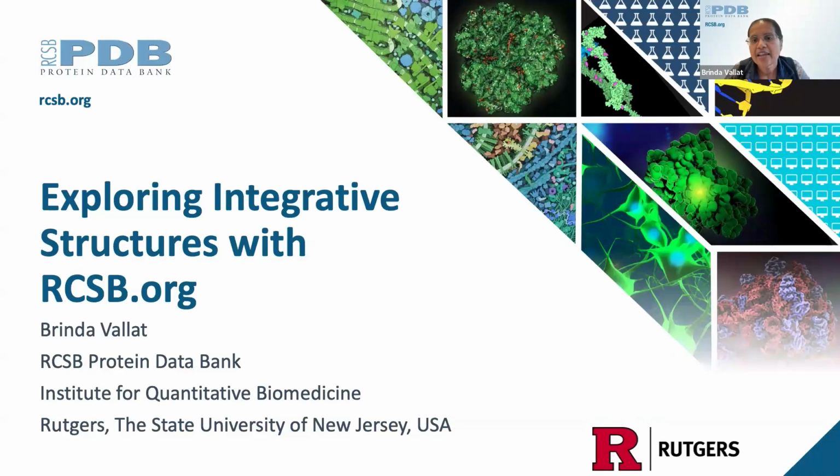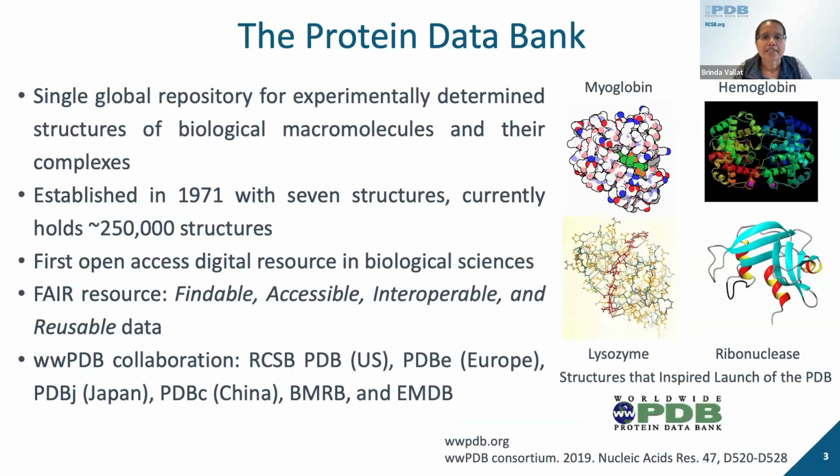So today, I'm going to provide an overview of what integrative structures are, how they are archived in the PDB, and what resources are available on rcsb.org to explore and analyze these structures. Let me begin with an introduction to the Protein Data Bank.